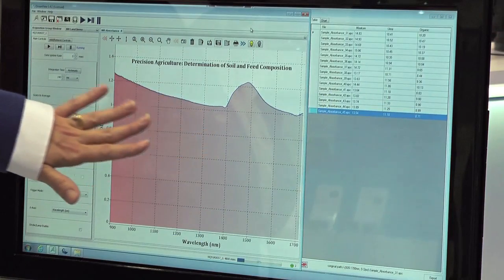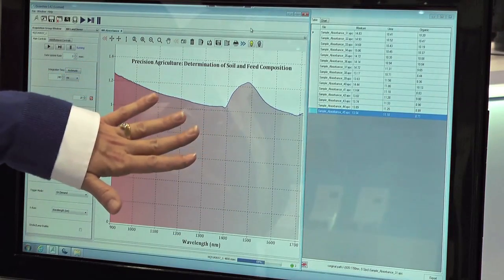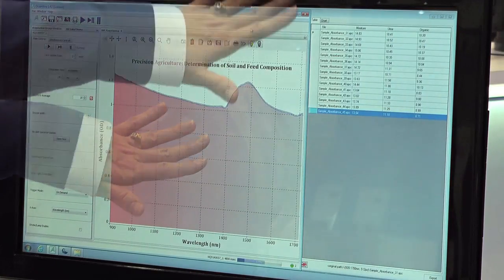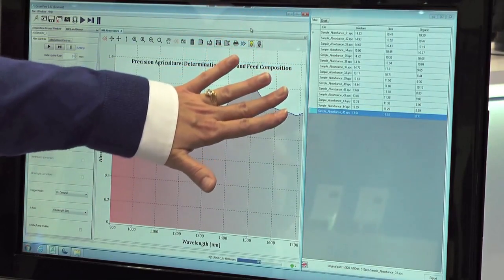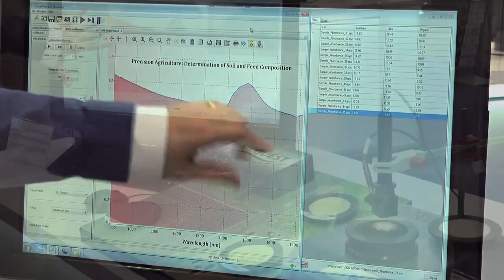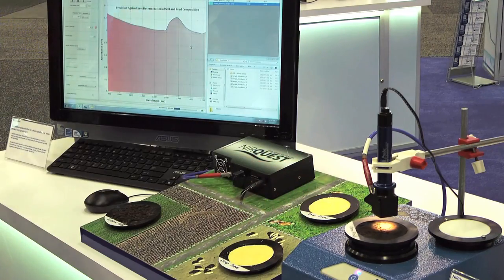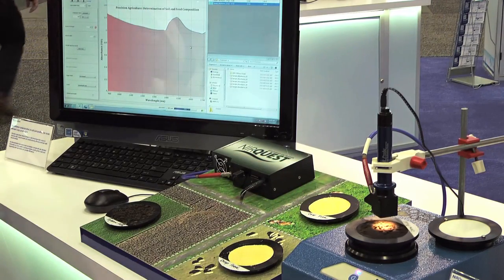We're using OceanView to acquire our spectral data. You can see right now we're seeing a spectrum for some soil from a cornfield, and then we're doing predictions in real time of the moisture, urea, and organic content for these samples. We're measuring 20 spectra as this rotates, and we're getting a nice stable spectrum.